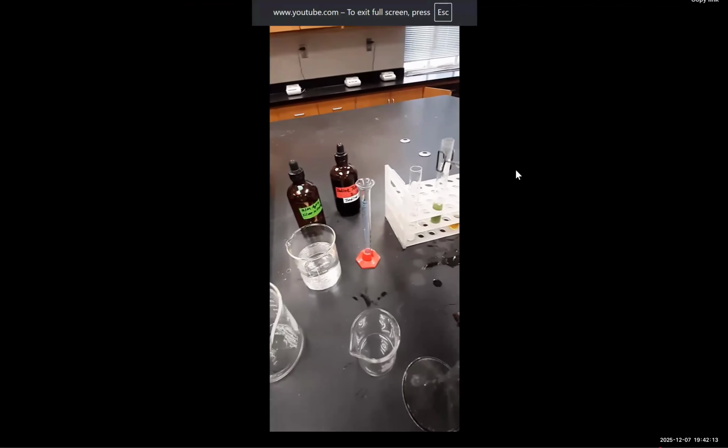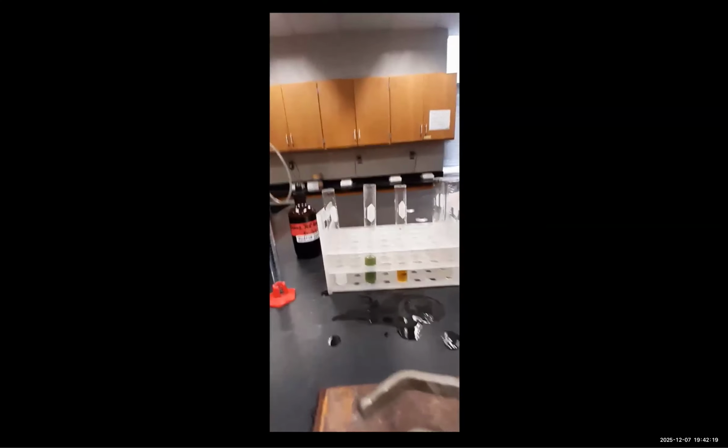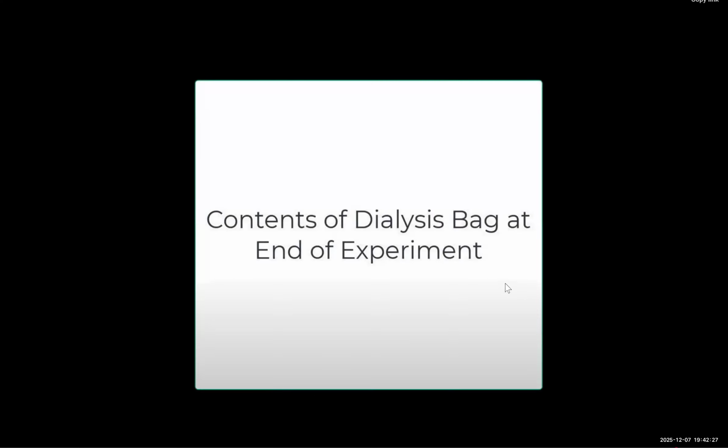Okay, now that we've tested the beaker water after 30 minutes, let's see what's still remaining in the dialysis bag. So let's take a look at the test results for the contents of the dialysis bag at the end of the experiment.